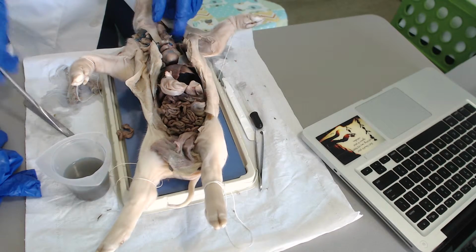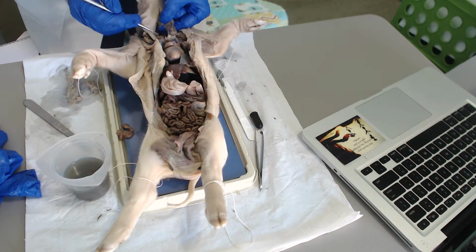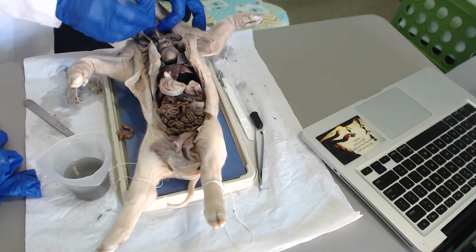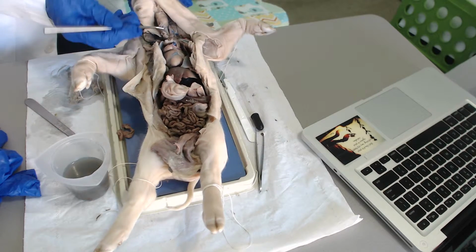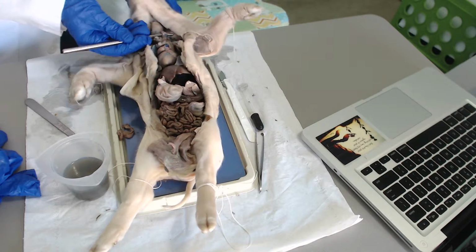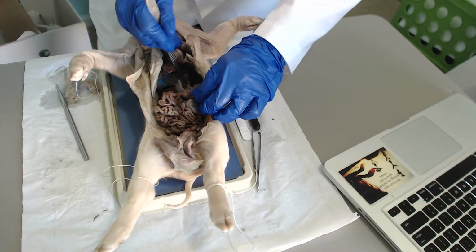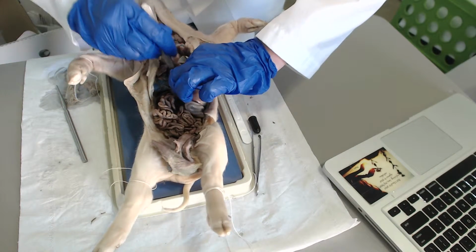Okay, we skipped over it, but I was going to also locate the esophagus. And let's see, if we go behind the trachea, there is a flexible tubing, and that would be the esophagus. So if we cut out the stomach very carefully, the stomach contents.